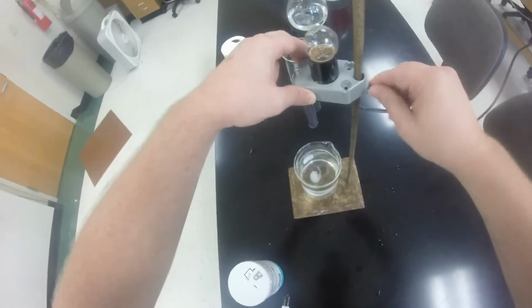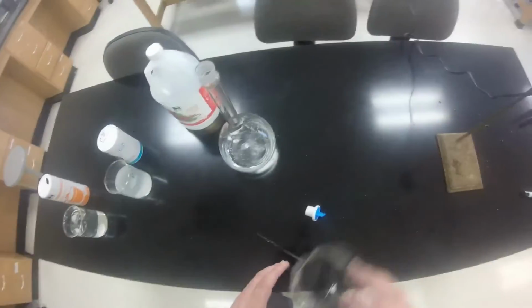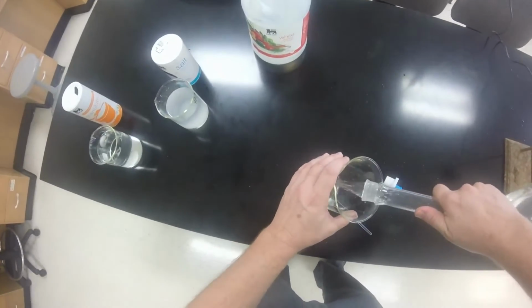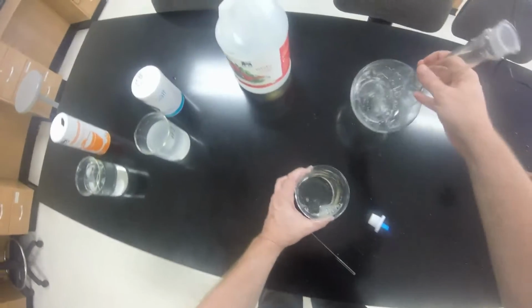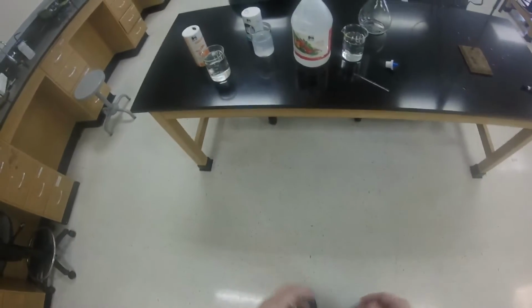Alright? So there's an intermediate between our sugar, which is our non-electrolyte, and our salt, which is our strong electrolyte. And this is our weak electrolyte. So we have our distilled water again. Alright? And weak electrolytes are generally going to be something like our weak acids, our weak bases.